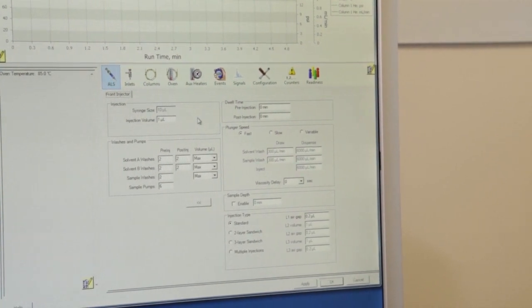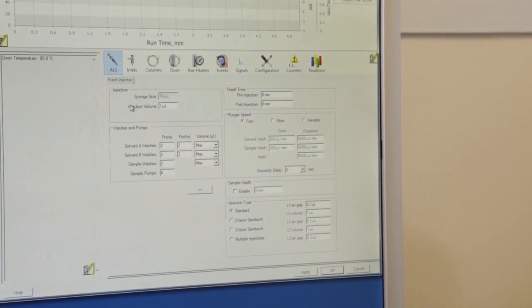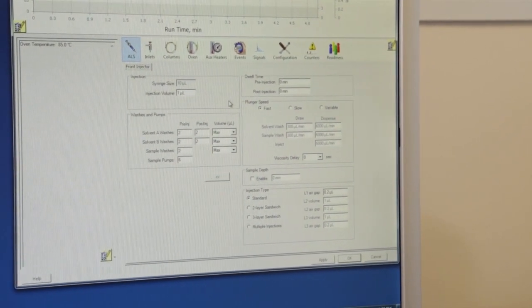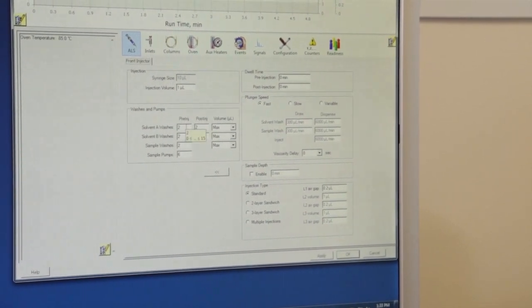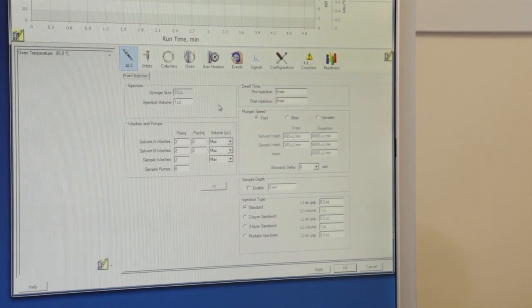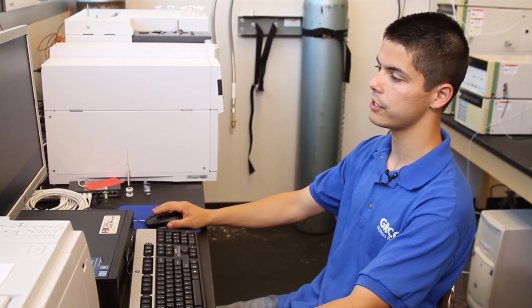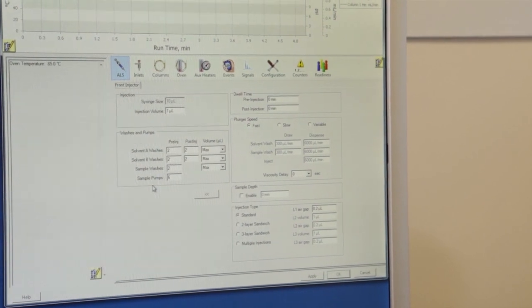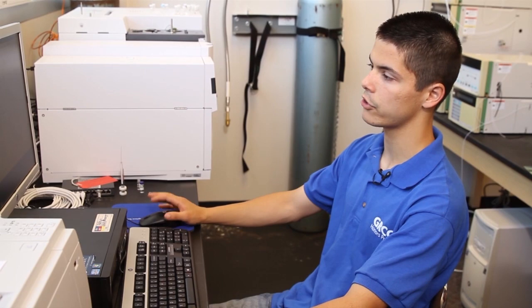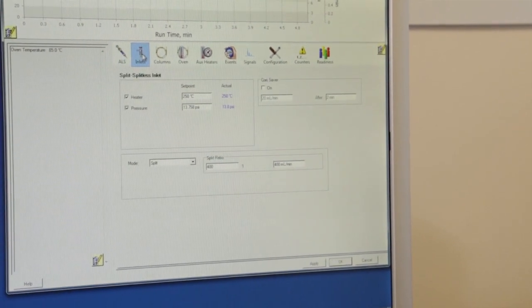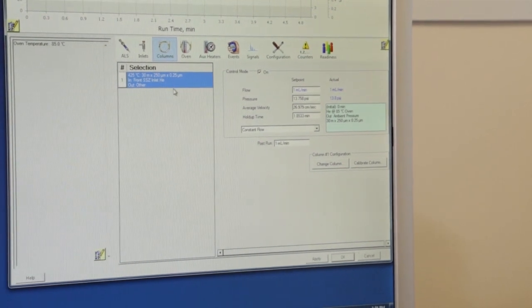The next settings are for the auto sampler. This allows you to select how many washes and how many pumps the syringe will do. Right now it has about two washes for each pre and post injection. This helps with the syringe, and it also has sample pumps — the reason for the pumps, as I mentioned with the manual injection, is to get rid of air bubbles and make sure your sample is actually injected. Since I did a manual injection, I don't really have to worry about this. The inlets and column settings are based on what I showed you before, so there's not much else to worry about.